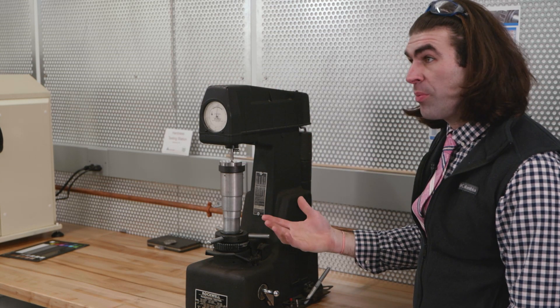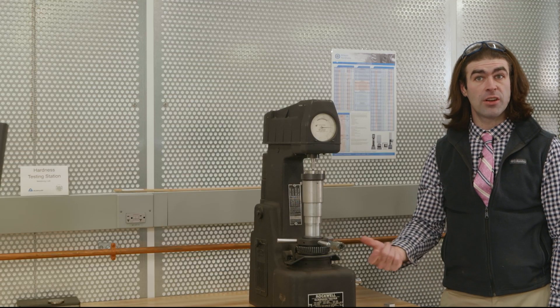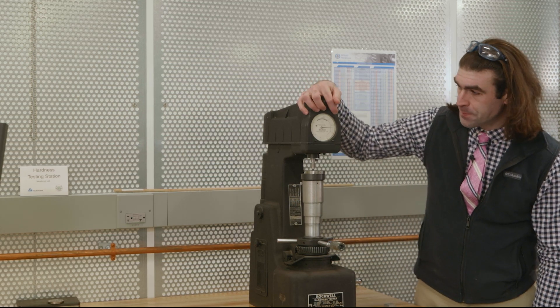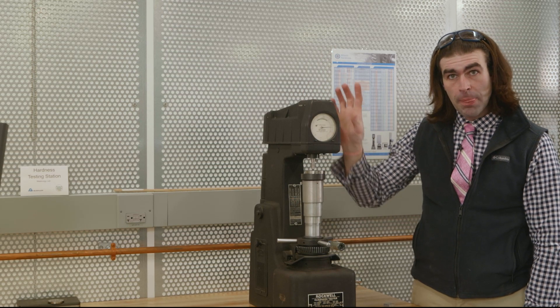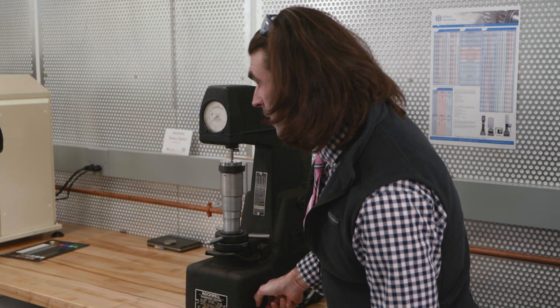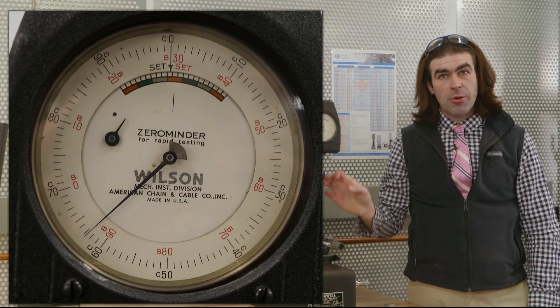This gets the machine ready to do its test. To perform the test, slowly press this lever — you'll see the handle move back slowly. That's an adjustable dwell time controlling how long it stays on the material. Wait for the needle to stop; sometimes the needle can do erratic things, just wait until it stops. The reading during pressing is not your final reading — your reading is when you pull the handle back. We're at a Rockwell 63.